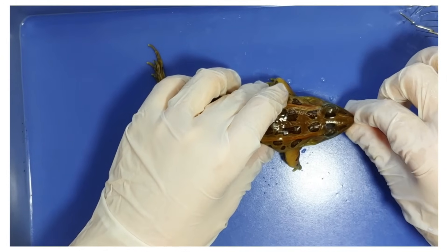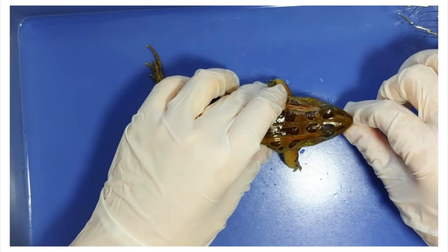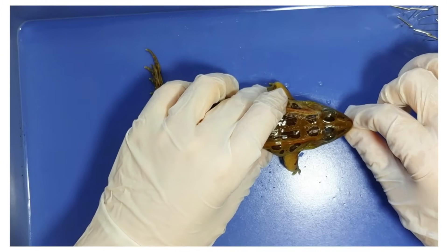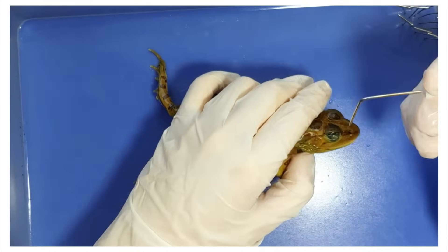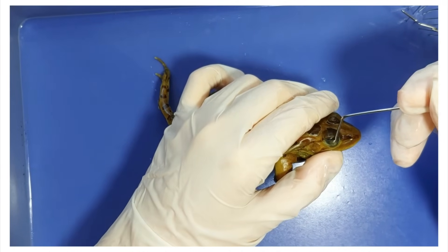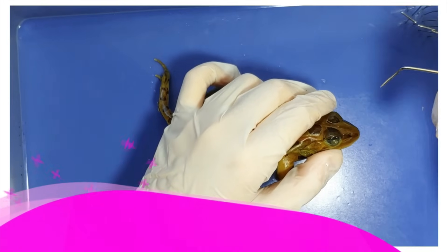The eyes and nose of a frog are on the top of its head so that it can see even while most of its body is underwater. Also, you can see the eyes of this frog are covered by this film, which is called the nictitating membrane.